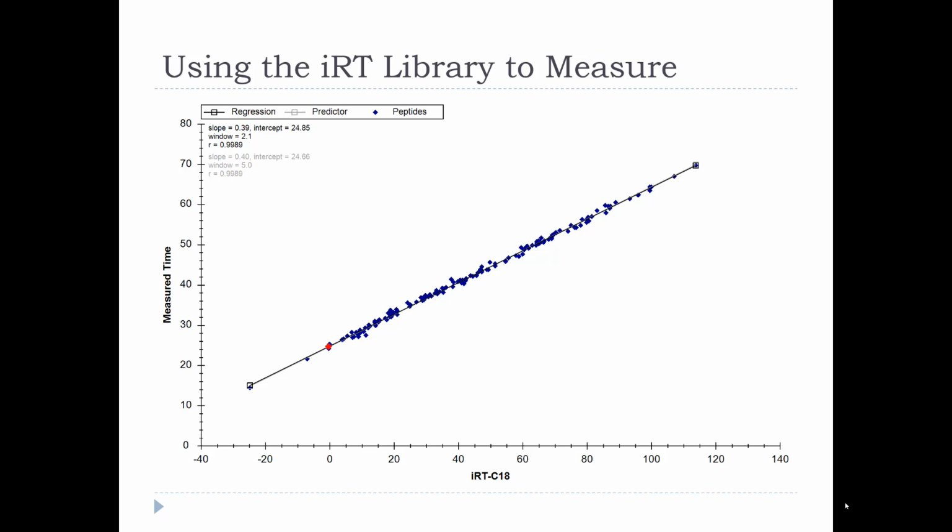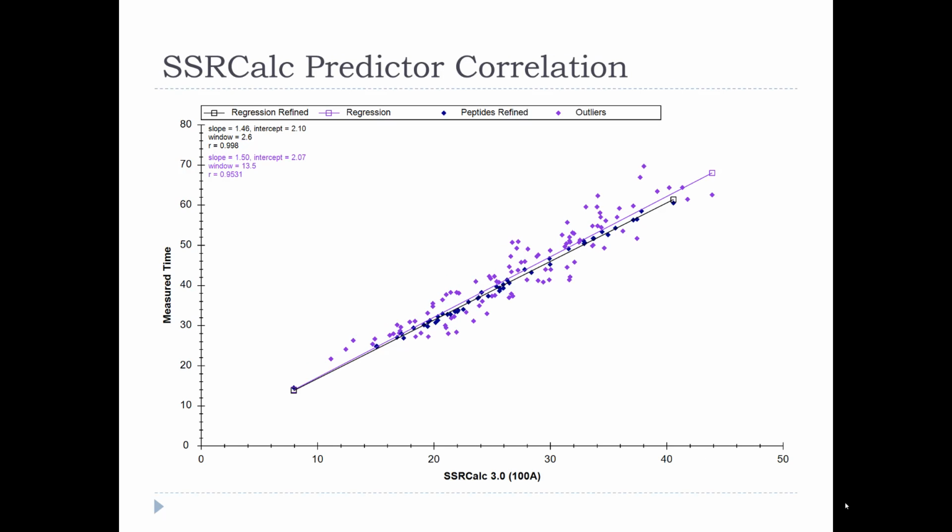These are all now predictions, or maybe they're measurements. And then these are the same set of peptides predicted by just the sequence-specific retention time calculator, SSR calc.